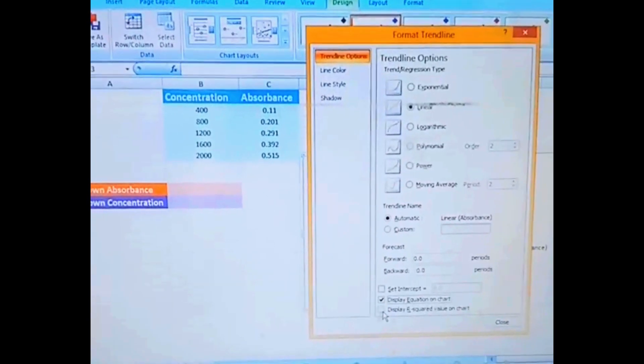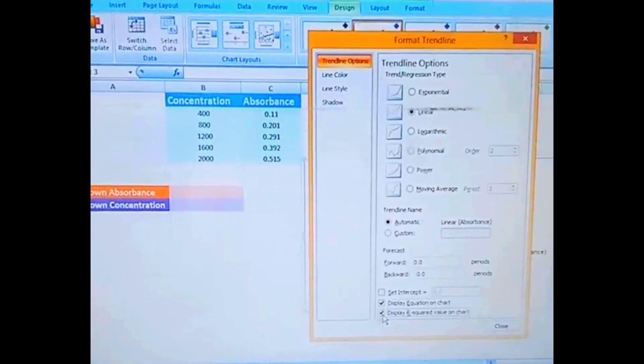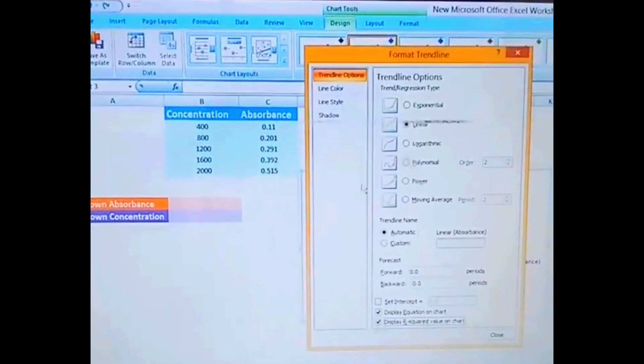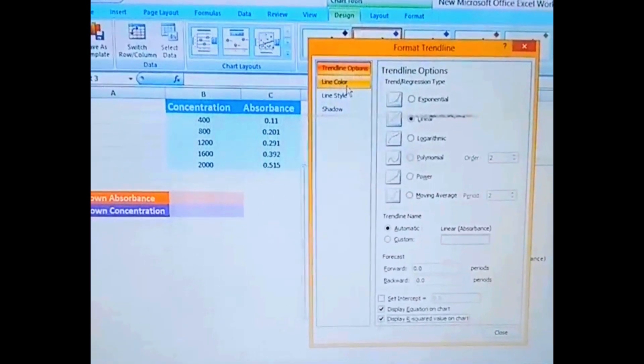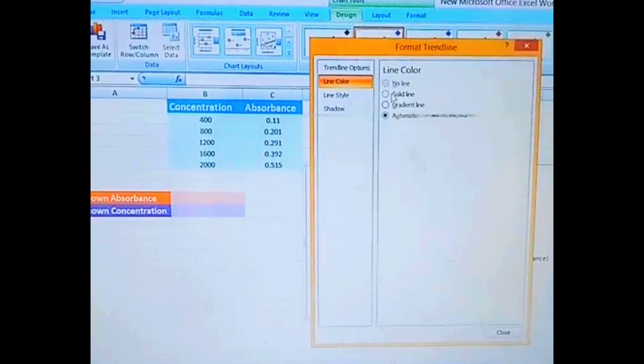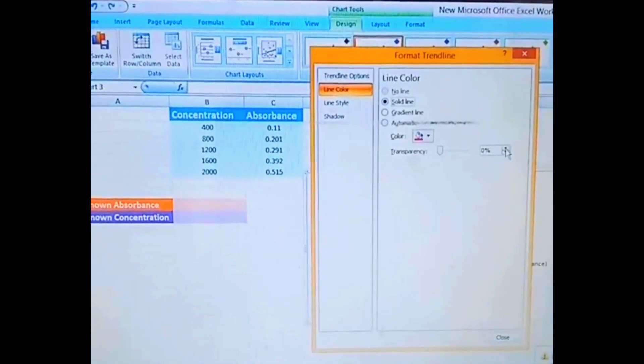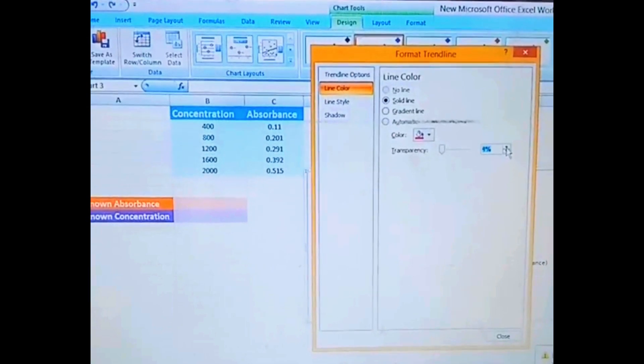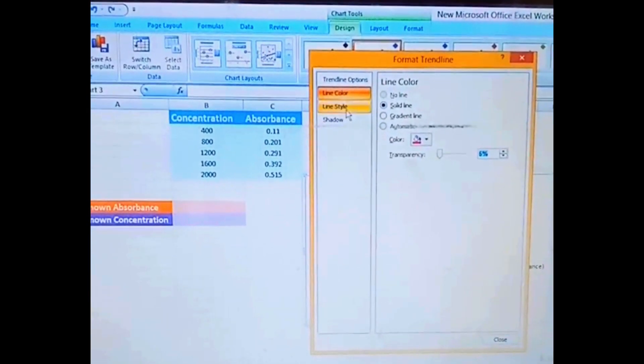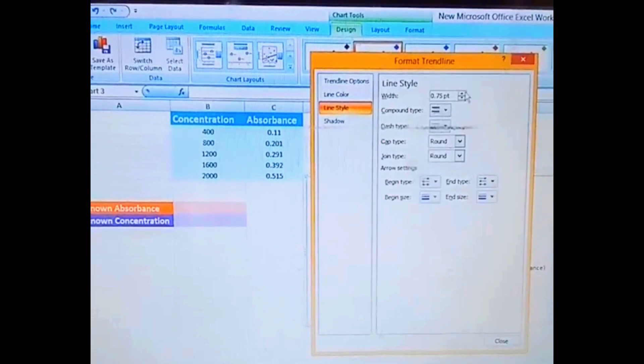As well, display our R-square value on the chart. And here are different things we can use, like I'm just picking here the red color with its different width.